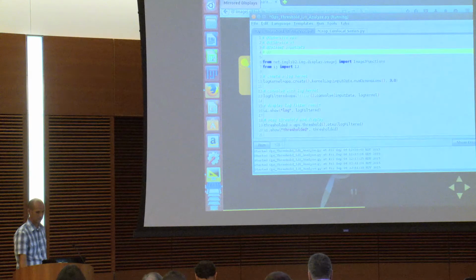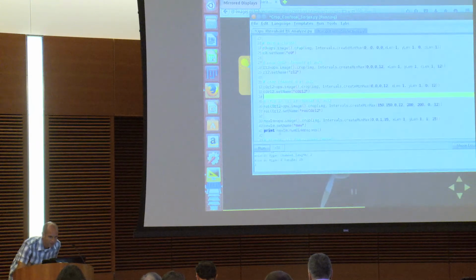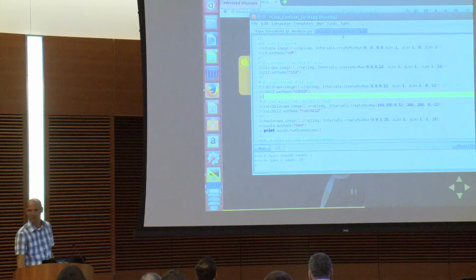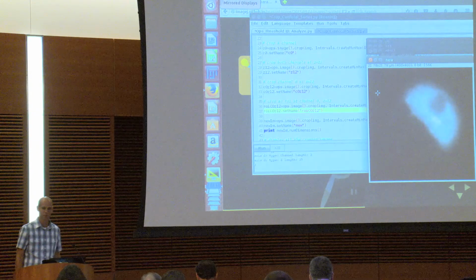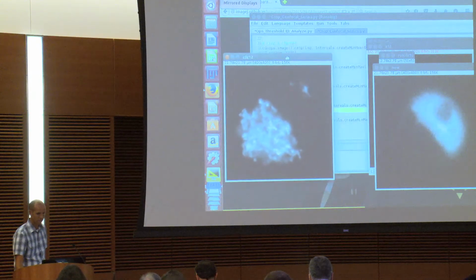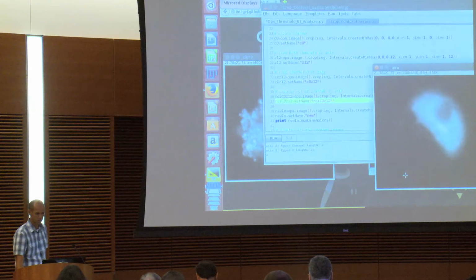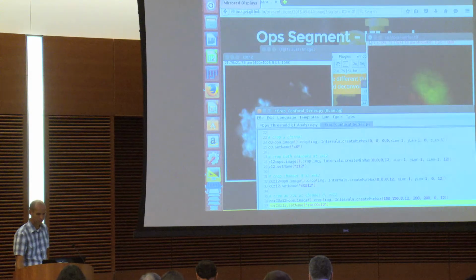Go to our first script, run it. Oh, no. I ran the wrong one. I added a parameter at the top that isn't complete. I just had the wrong script highlighted. This is the one I want, the crop confocal series, and I get these images to work with. I think this Z012 works pretty good with the thresholding. And if you want to avoid image explosion, just close all these.